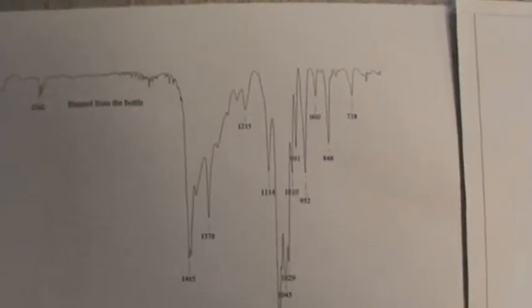So we have some starting material. And as typical, this is where we have a spectra of butanol from the bottle. So we get a little bit of a look here. There it is, it's pretty obvious. You're getting used to this. How many functional groups do we have present? You have an alkane and you have an alcohol.